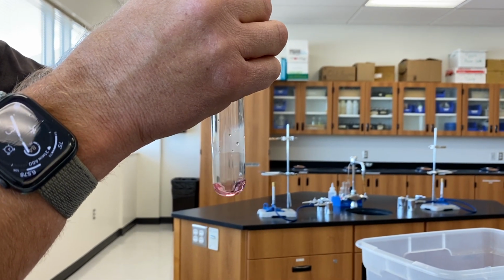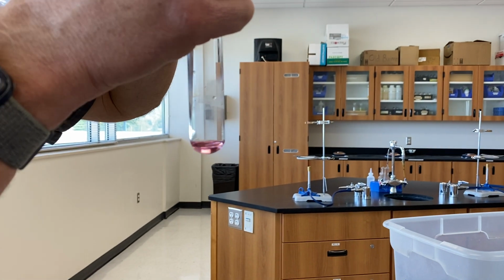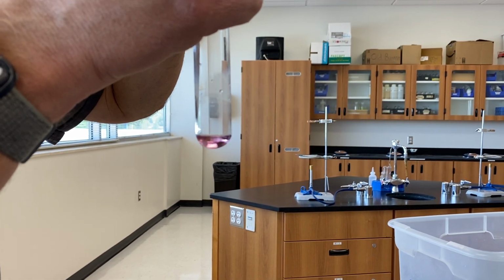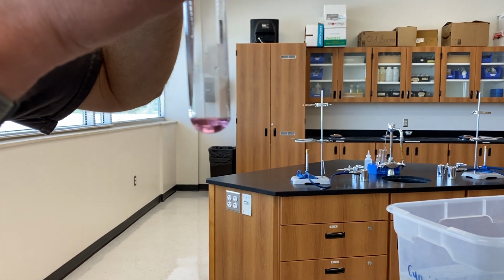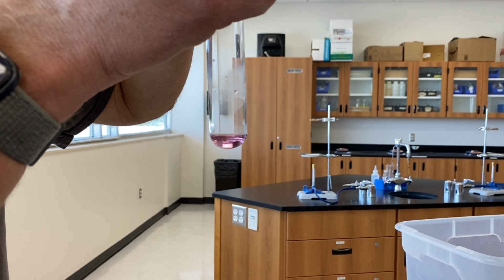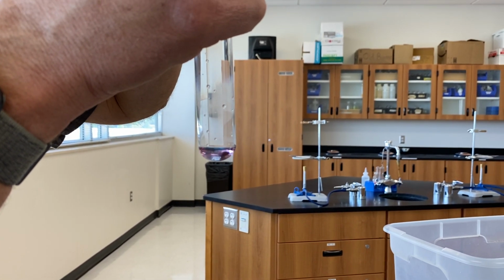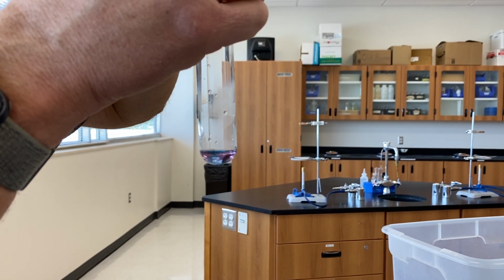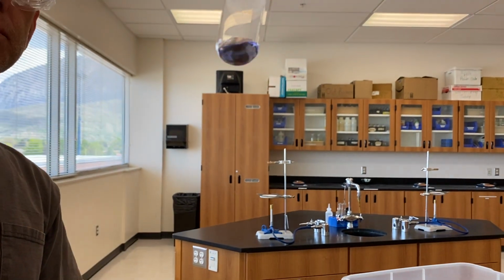All right, we're almost there. All right, so now we've got our color change. Can you see that color there? You can kind of see that it's turned to a more purplish color. Okay, now we're going to add 5 more drops. 1, 2, 3, 4, and 5. And at that point, we'll have our appreciable color change.